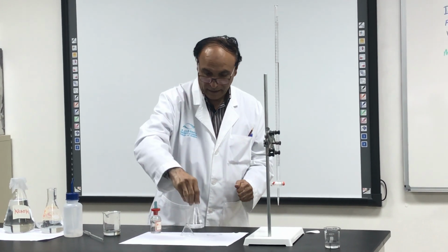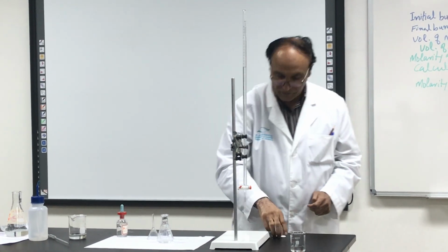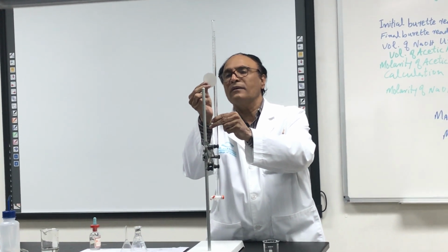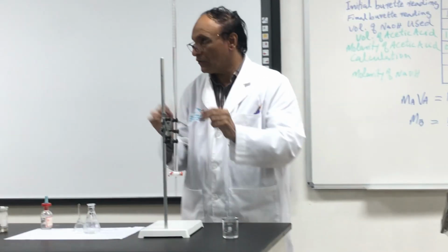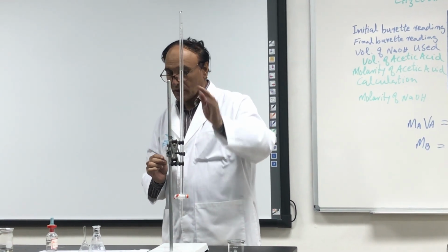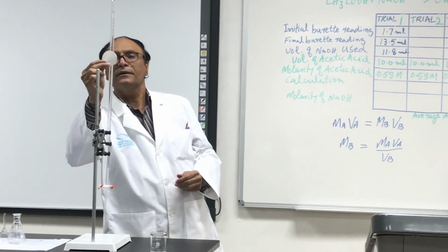And this is ready. Now we want to know the volume of this one. Its volume is now 14.5. The new volume, because I took more. You remember? Yes, I put more. So it is 14.5.